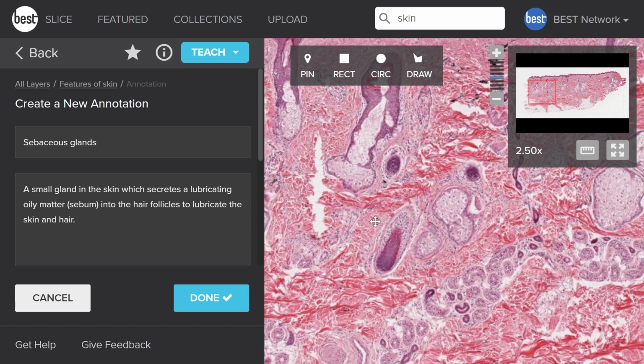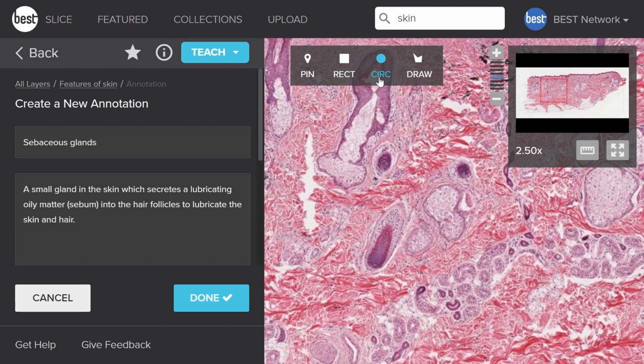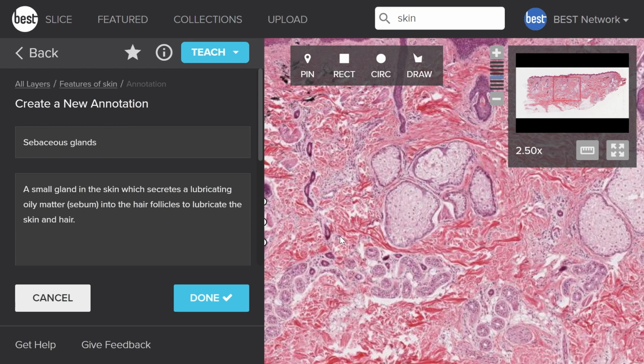We've got circle and rectangle tools to use these. We select the tool, move to where we'd like to start, and I will hold down my mouse key and stretch that out so that I draw around the shape that I'm trying to mark, the feature, and drag in those edges if required. But my favorite tool is the draw tool. So using that, I've got the crosshairs.